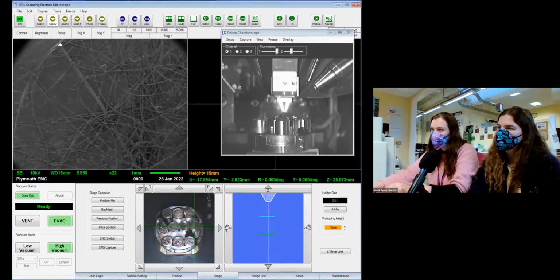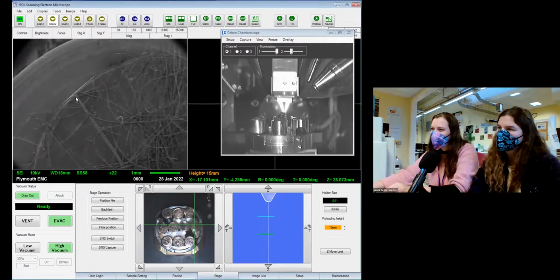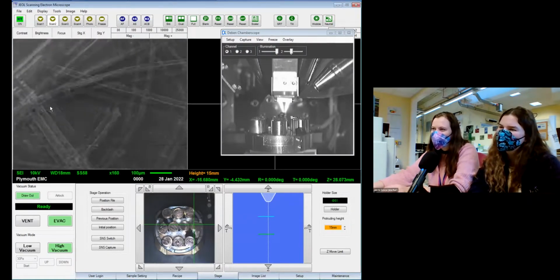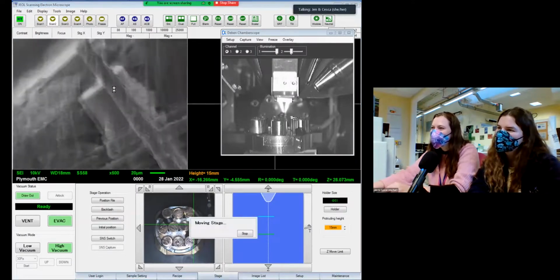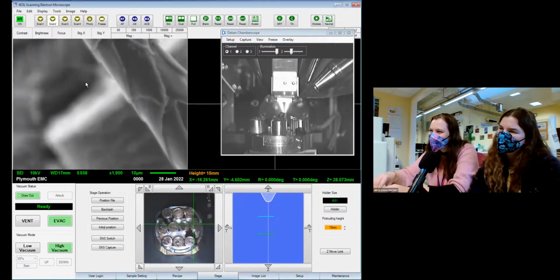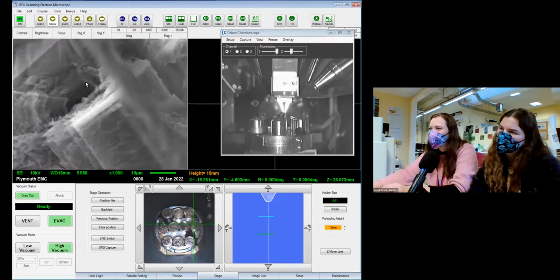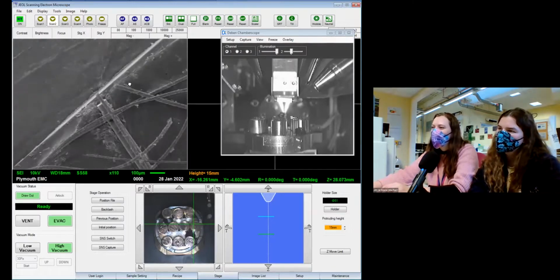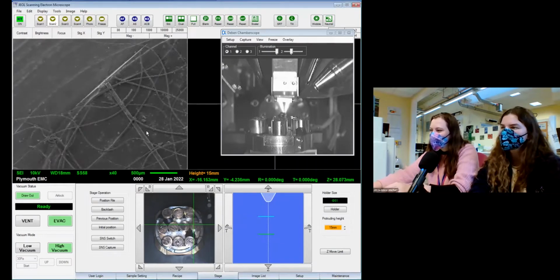I wonder if I can just see inside the dog hair. Have I cut any of them at a sensible angle? Not really. Not quite, no. I wonder if I can focus past it. Yeah, kind of. Oh, there's a hint of a structure. I might do a drive round after the session's ended and see if I can find some proper ones at the edges. Good plan.